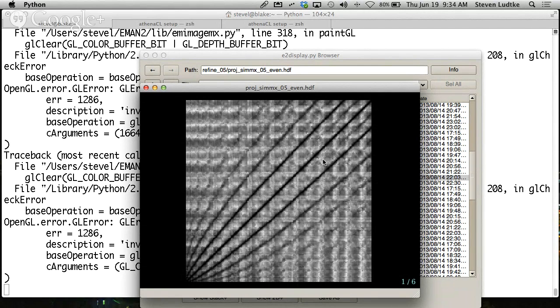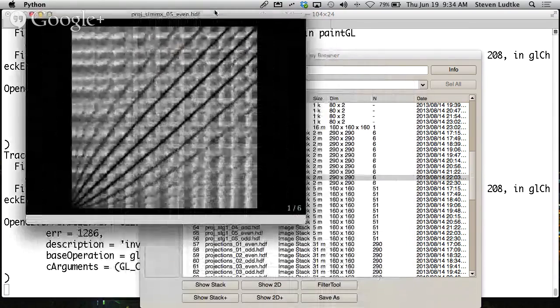Okay, so smaller is better. So that means that the particles agree with themselves very well. So the projections agree with themselves very nicely, as you would expect. And then we have another little stripe across here. This indicates where we have stepped up one step in azimuth.